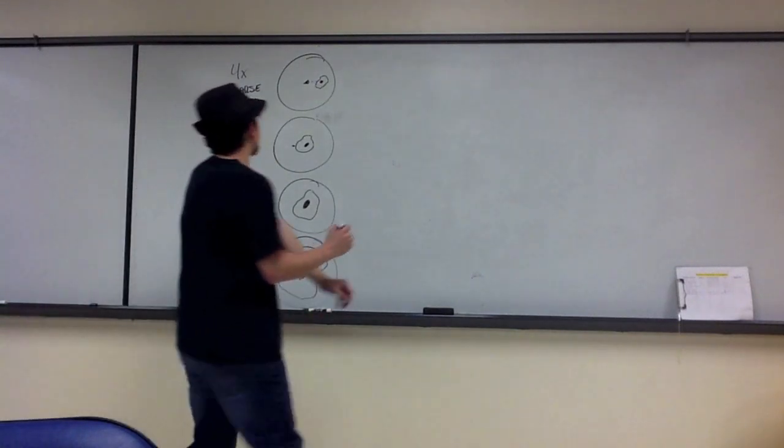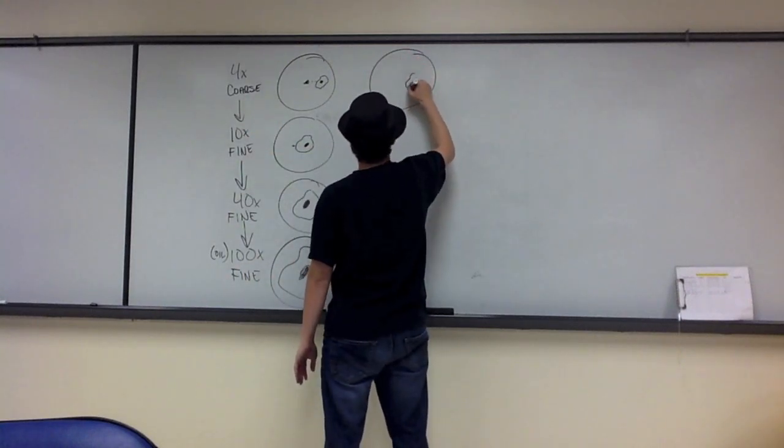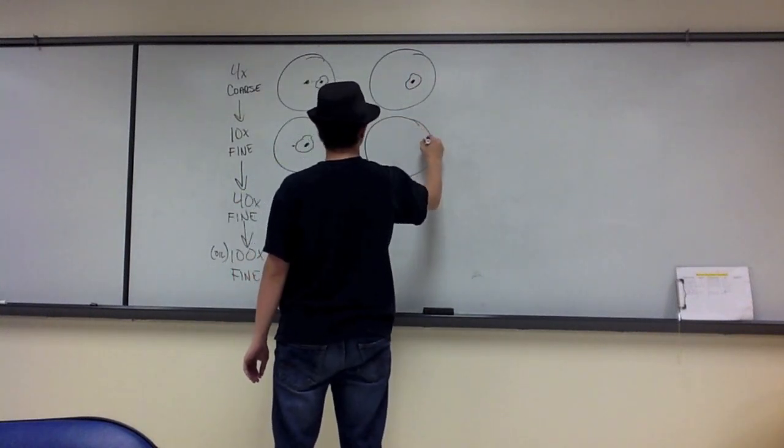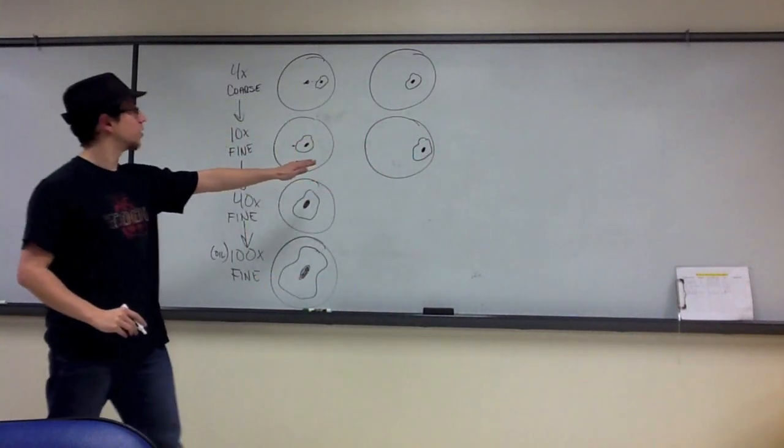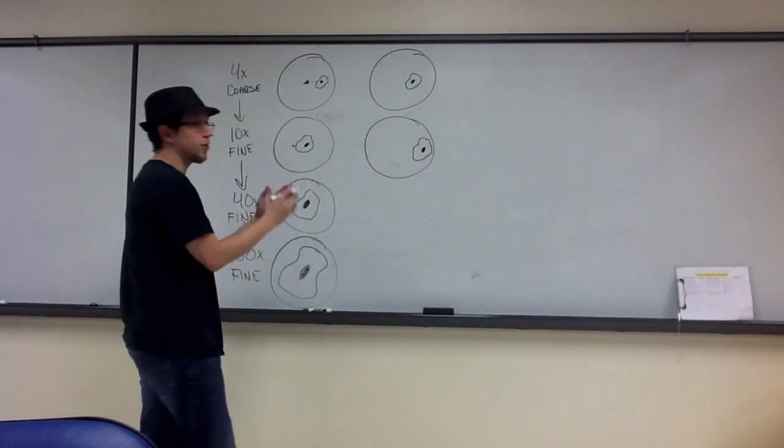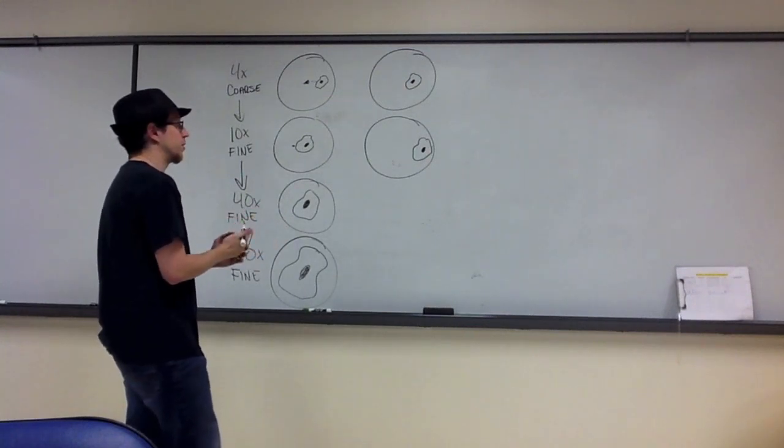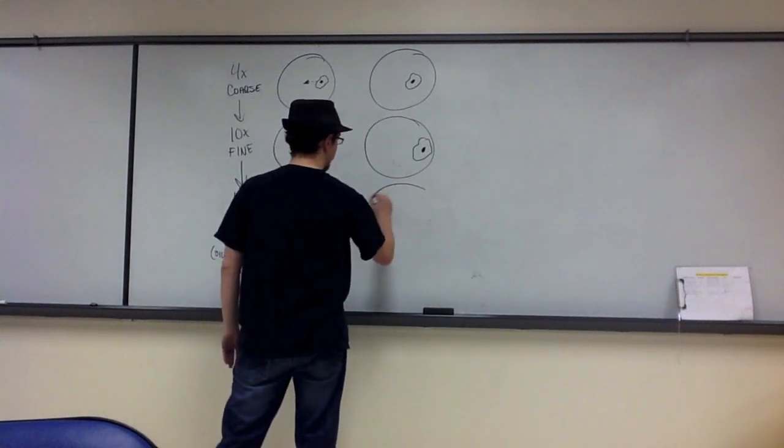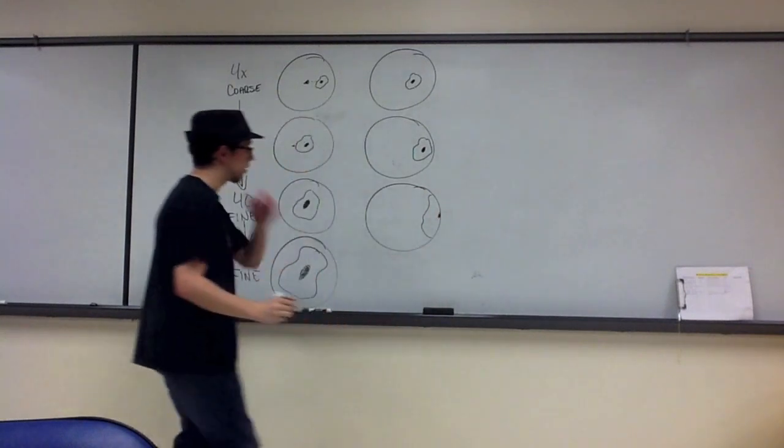Here's what happens if I didn't recenter that. I'm going to follow the same steps, but I'm not going to recenter. As I zoom in now, notice the cell has shifted slightly in the field of view, because I'm now looking at a smaller surface area of the slide, and the cell happened to be off to the right. So I'm going to bring it up to 40x. Maybe I'll get something like that.